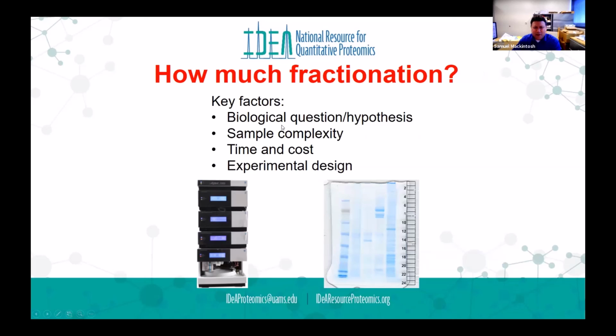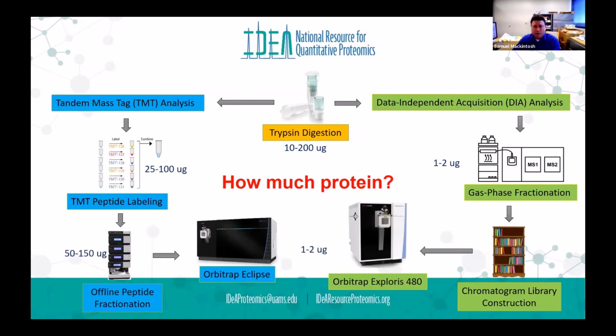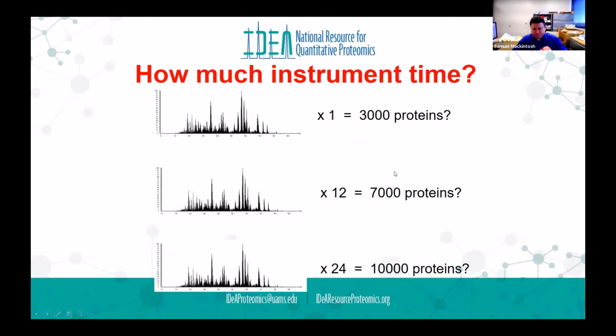And we've already talked about fractionation and varying that to fit the experimental needs, and we've kind of talked about this here. And what else do we have? How much instrument time is related to fractionation? So this is probably a good time. I'll just talk about this proteomic depth here, and then we can see if anyone else wants to talk about their experiments.